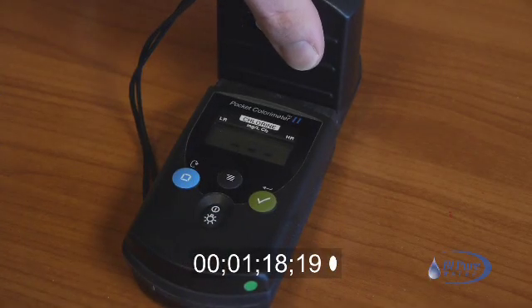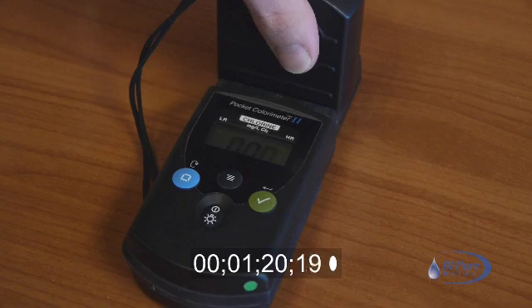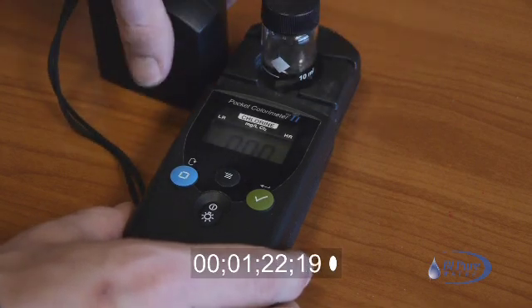Press the zero button and wait for the instrument to show zero, and remove the reference cuvette.